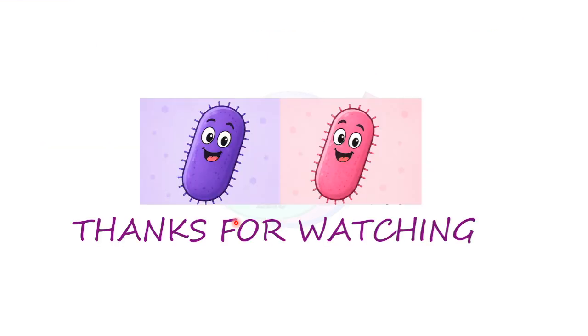So this was all about gram staining and the basic differences between gram-negative and gram-positive bacteria.